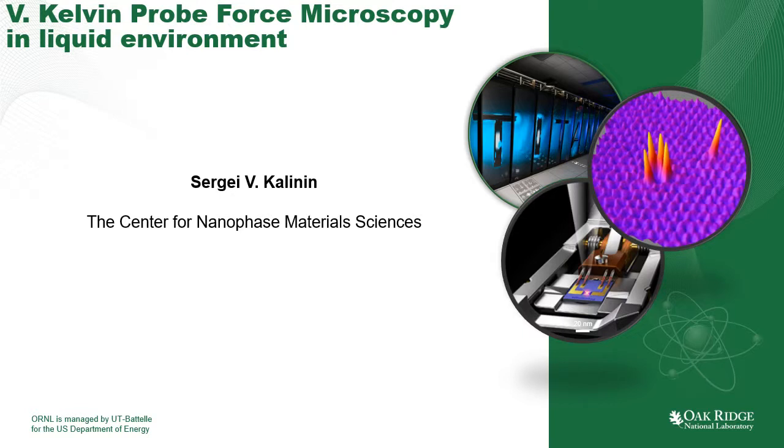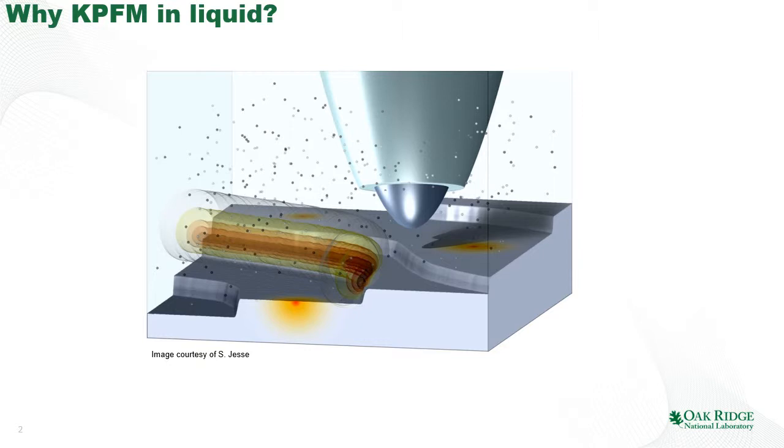Hello, and welcome to the fifth lecture in the series on scanning probe microscopy methods for probing ionic and electronic transport. In this lecture, we are going to talk about the implementation of Kelvin probe force microscopy and related techniques in liquid environment.